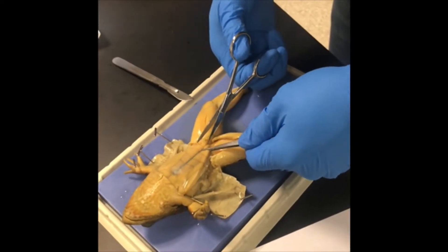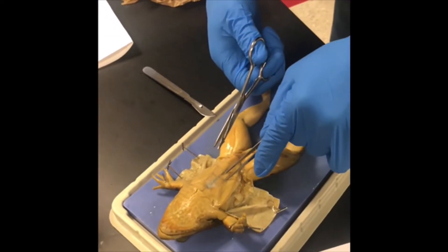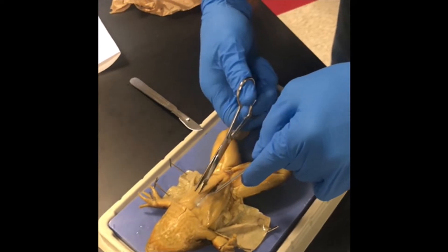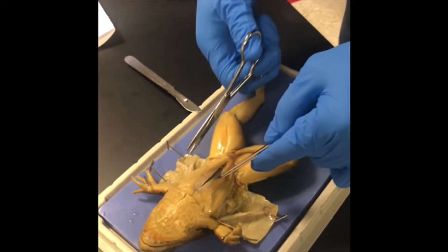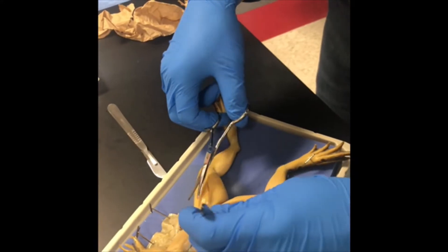We're going to begin the first muscle incisions. Begin the abdominal muscle incision by using the forceps to lift the muscle away midway between the rear legs of the frog. Next, use the scalpel to start the incision. Carefully continue the incision up the midline of the frog, but do not cut deeply as you may damage the organs.